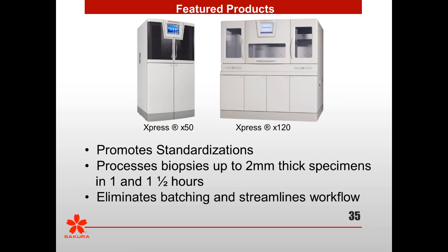If you have a large variation in the type of samples from fixation and processing, I think you'll have more difficulty, just as you would with a Prisma or a Leica, what we call the dip and dunk. So it's a bigger question. I really don't have a suggestion for which one will work better, because we have so much variation in our lab that it's still pretty much a lab-to-lab dependent decision.